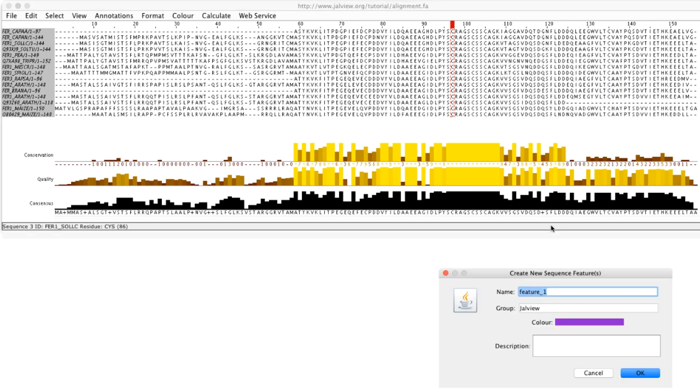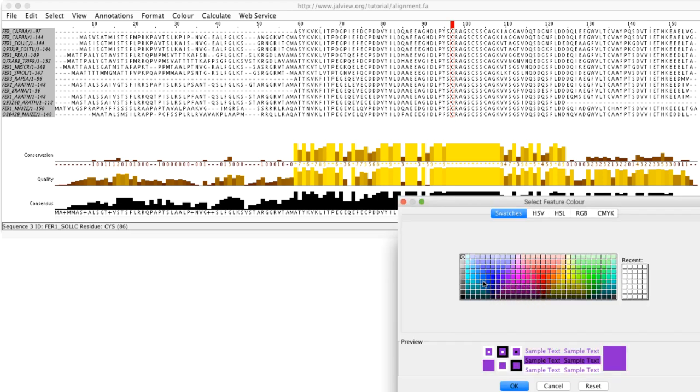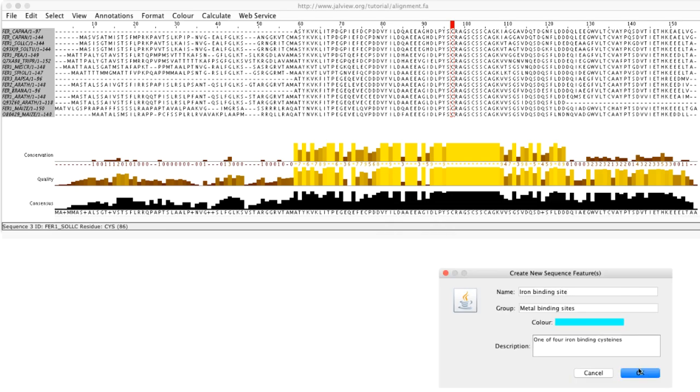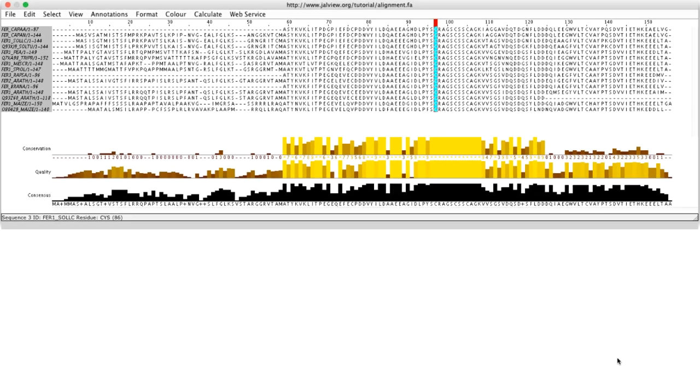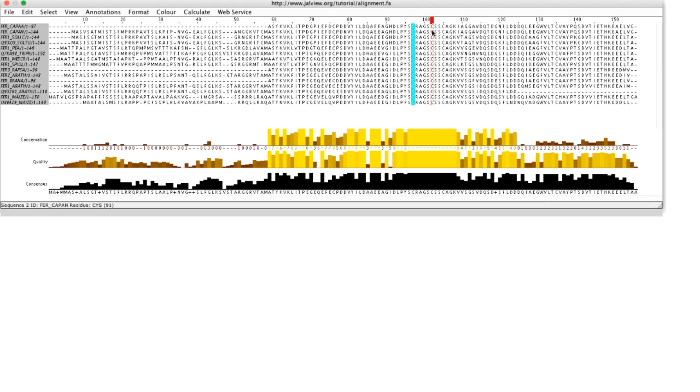I select selection and create sequence features. A dialog box will appear. I enter a suitable sequence feature name, add text, click on the feature color box to change the color and click OK. The features appear on the sequences at this cysteine residue.